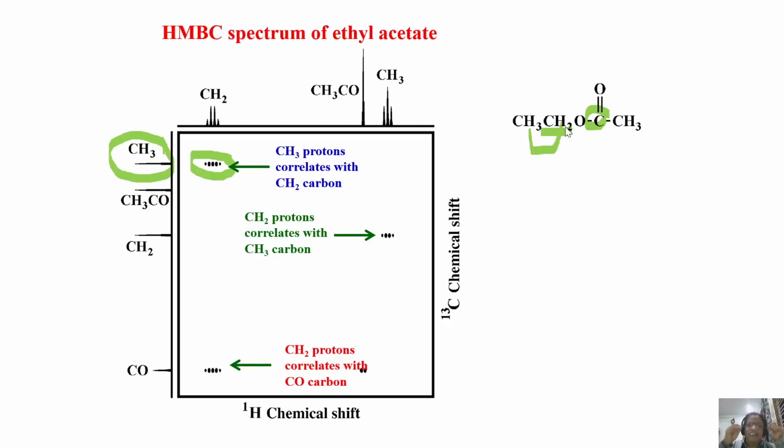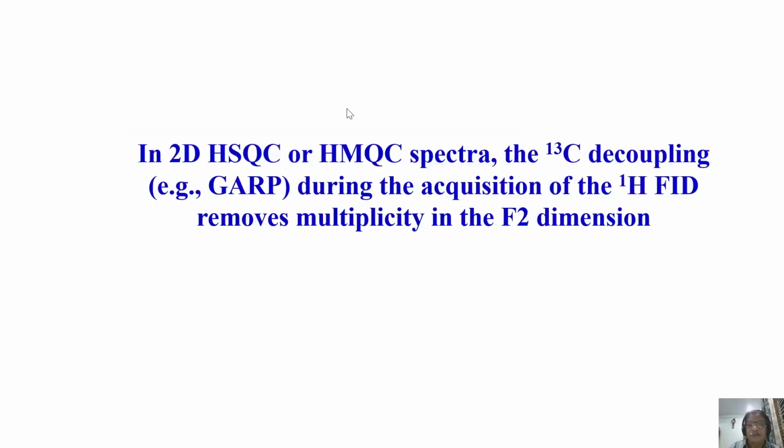Remember, this is what you routinely use in your carbon-13 NMR, in your proton NMR. If you want to study synthesis of a molecule and get proton-carbon correlation, proton-carbon chemical shifts, couplings, and how to assign each carbon and carbon chain, you can get the proton-proton nearest neighbor by COSY, TOCSY, etc. But if you want to find out which carbon is next to this proton, you can do this type of experiment, long-range proton-carbon correlation like HMBC type experiment. Okay, so this is what it is.